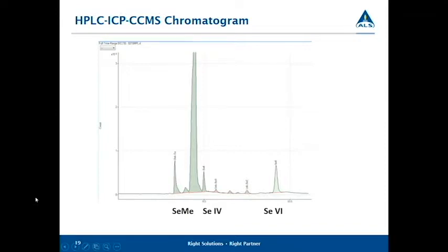The differences that you often see are often to do with biological samples or biological treatment systems, where you get all these breakdowns of other compounds occurring. So considering the multitude of selenium compounds, ranging from volatile selenium compounds to proteins, it's not surprising that there still are some unknowns out there. But certainly I think the analytical chemists are keeping up.